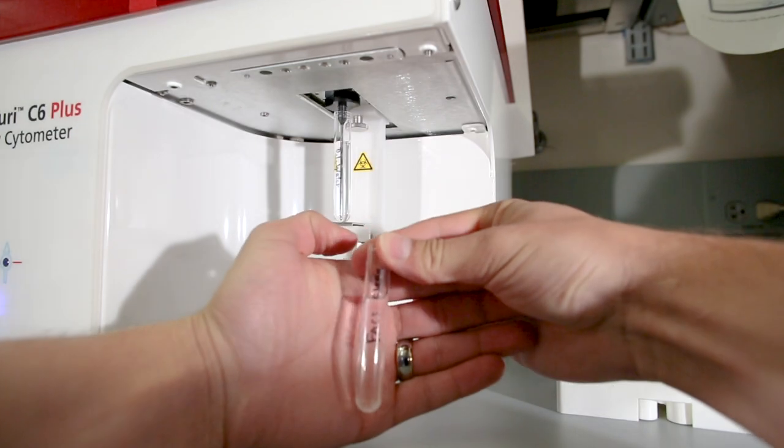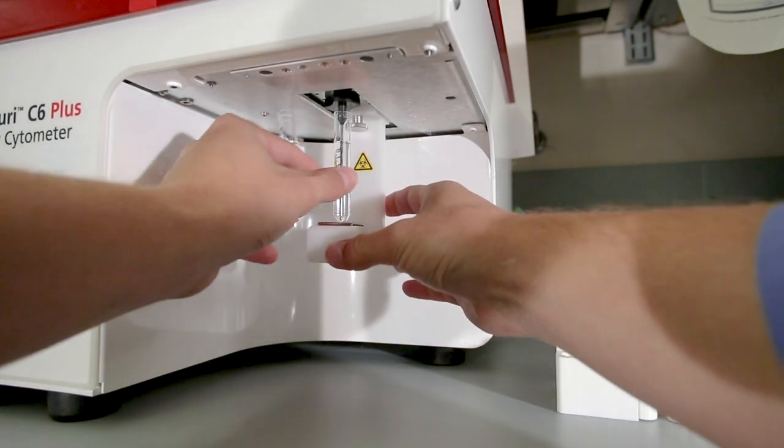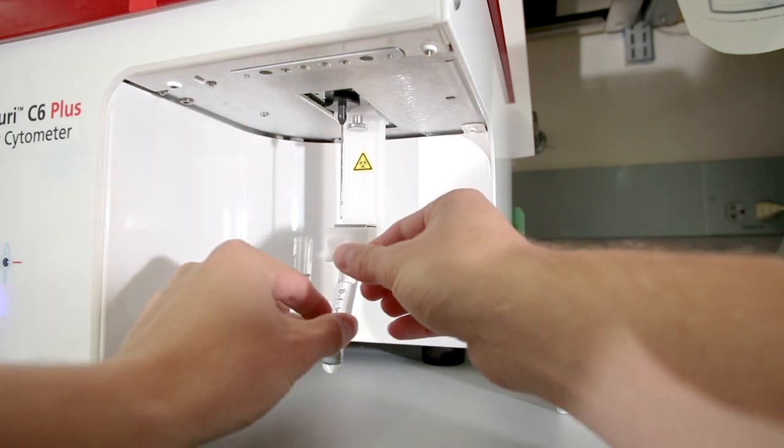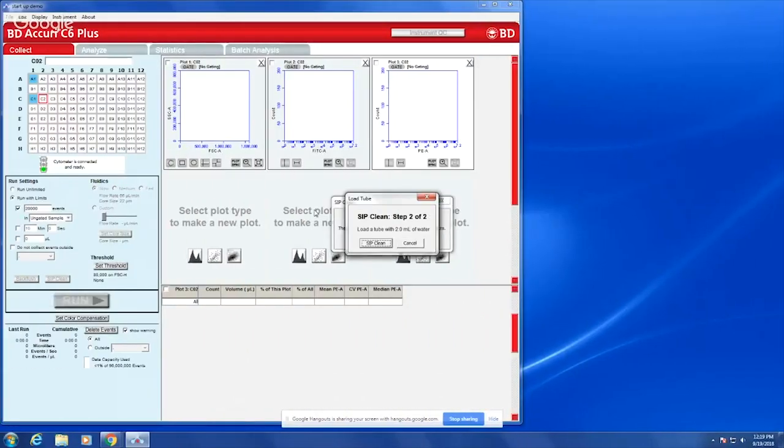The process for shutting down the machine is similar to the flush. Put at least two milliliters of Fax Clean solution to run in a clean tube. Run the sip clean function as you did earlier.